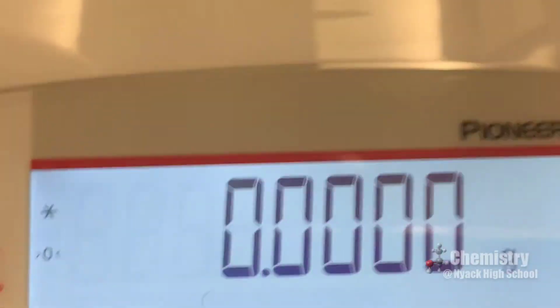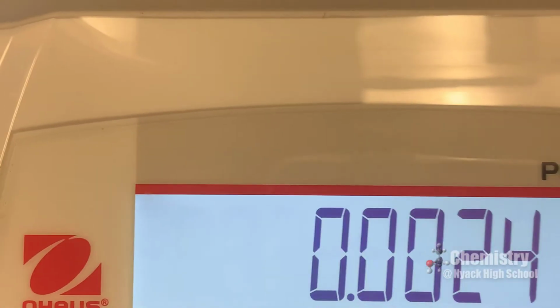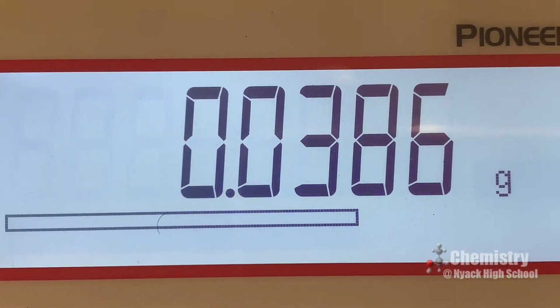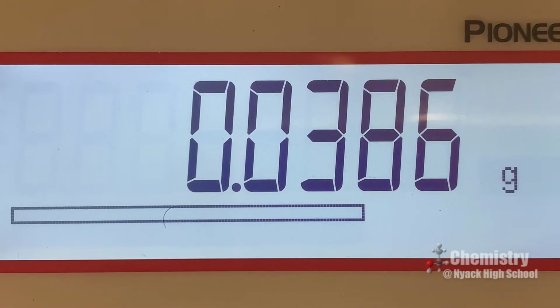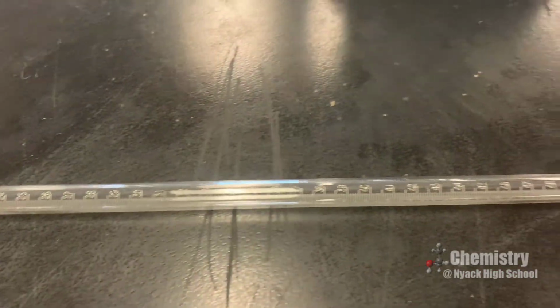Okay, so at this point I'm going to measure the mass of the strip of magnesium and put that on the scale. The mass of the magnesium strip is 0.0386 grams.